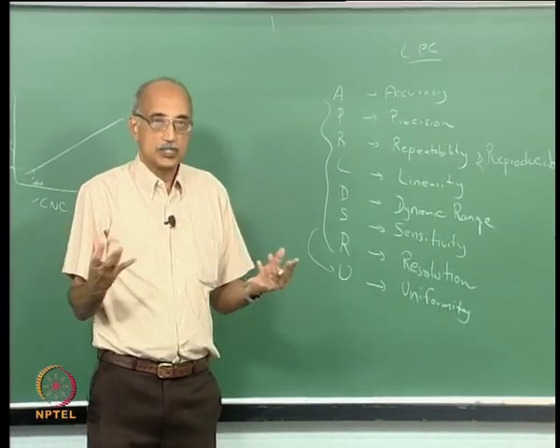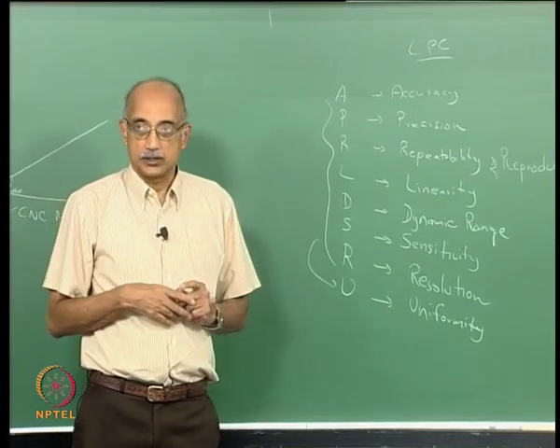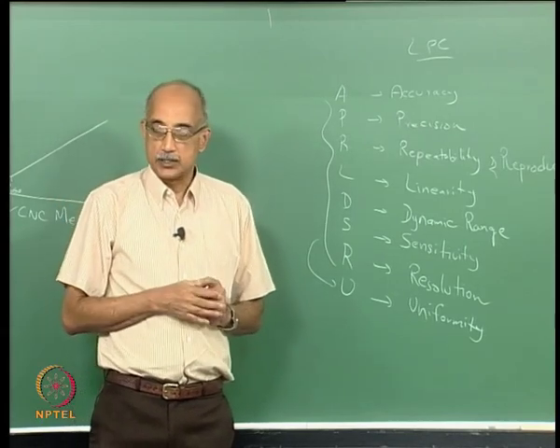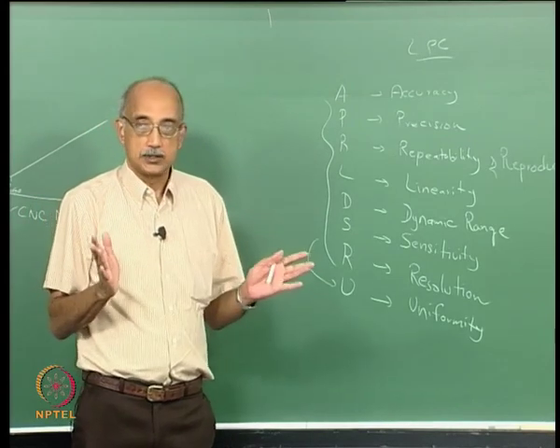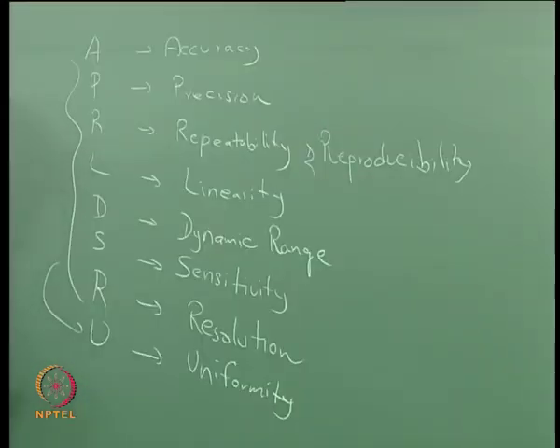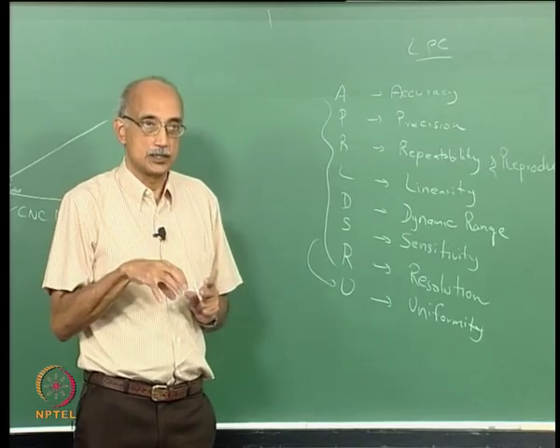of establishing these standards. So in the US, the National Bureau of Standards, which is now known as National Institute of Standards and Technology, does the job, and similarly in India we have a Bureau of Standards. They provide absolute standards that you can calibrate your instrument against. Now these standards are also known as gold standards because they are absolute and non-varying. So for example, in the case of particle counting, the gold standard still remains collecting the particles on a filter and using microscopic inspection to do counting and sizing.